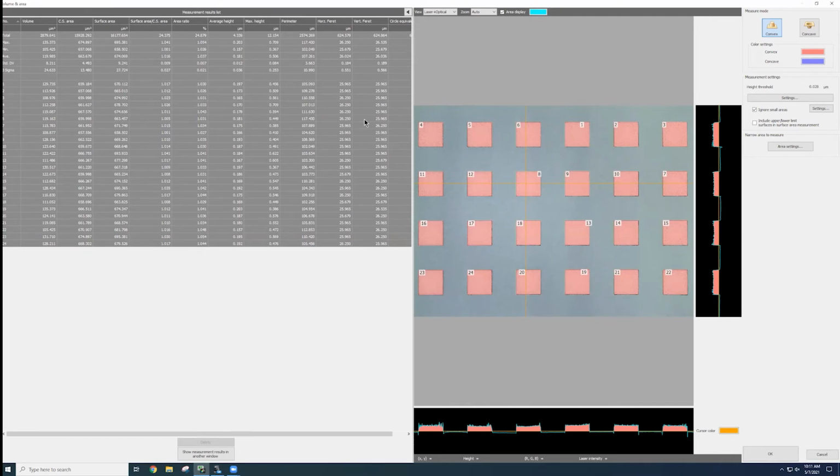It kind of depends. Sometimes you have wells instead of pillars, and so you might need to know what the volume within that well is if you're filling it up with fluid, for example. This kind of information.